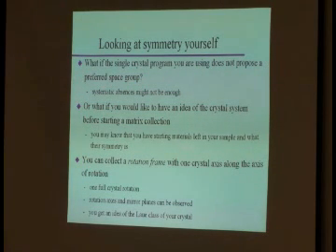Or maybe you would actually like to have some idea of what your crystal system is before you start collecting your matrix. Maybe you know that there's an impurity phase in your system that is cubic, which you don't expect for your product, okay? Do you have to collect a half-hour matrix to find out? There are actually other options, okay?